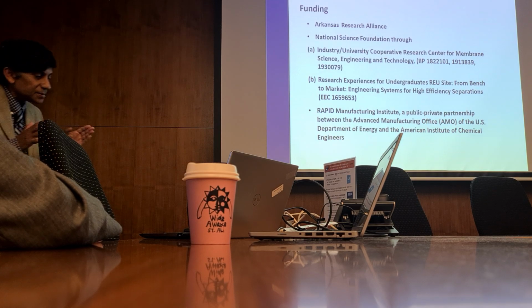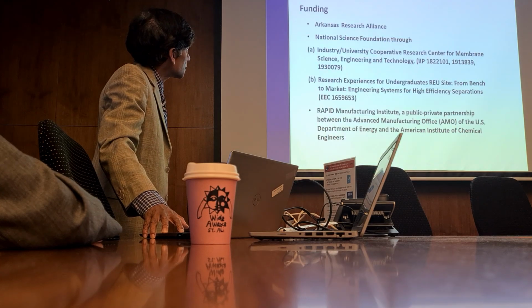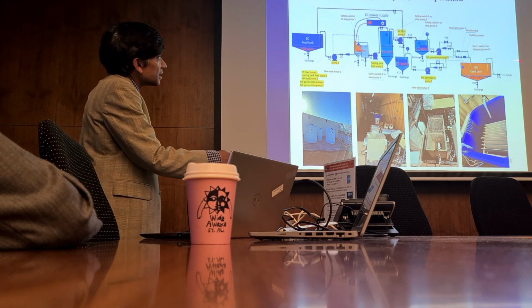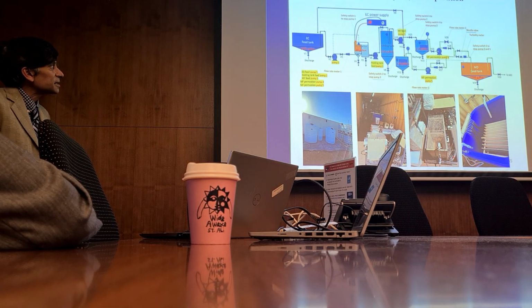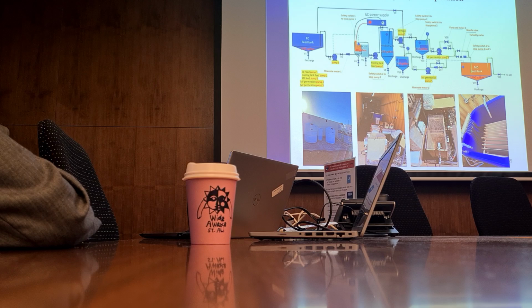The pilot was simply, if I can go back to that figure here, oops, sorry, going too far, simply this. Yeah, that's the process. So this is the part we worked on, and then they had their MD step here. There was no idea of crystallization; that was something we worked on later on. So no, there was no wetting issue for them. That was part of the whole thing: we needed to make sure that our pre-treatment was such that they wouldn't have wetting of their membrane for the time that they ran it.